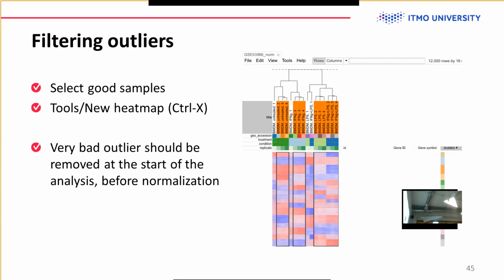If you have 2 replicates, you can't really tell if one is an outlier or not. And if you can't tell, you can't really remove it because it's very hard. Even with 3 samples, it's hard to do some statistics. With 1 sample, you can't really do almost anything. So if you take part in experimental design, remember to account for outliers.